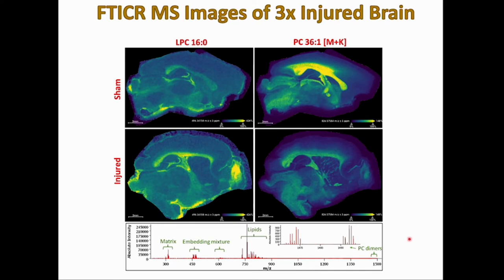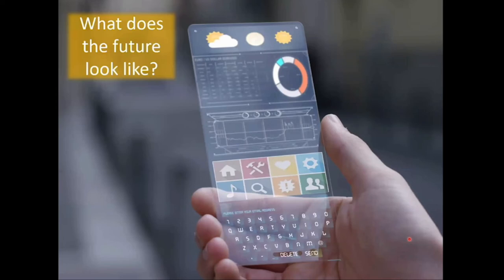So you have an idea of how the traditional experiment in lipidomics can be coupled to imaging. So you could go and look for these lipids in blood or, vice versa, look for some of the blood lipids in the brain tissues and so on.